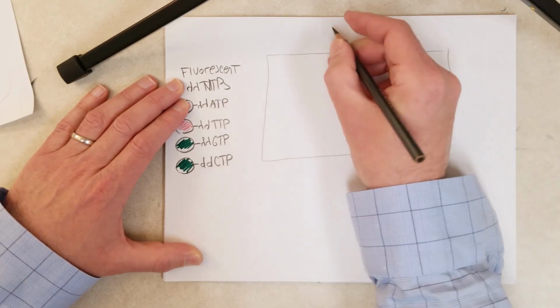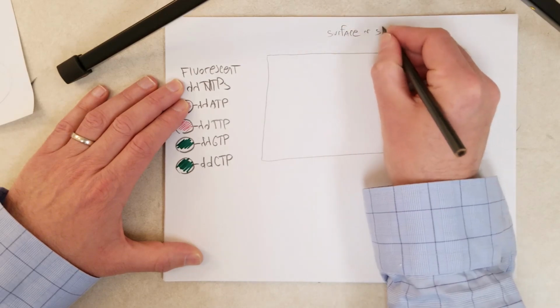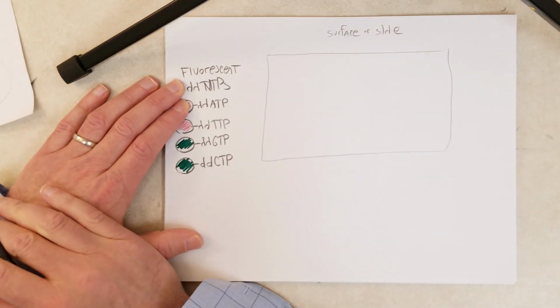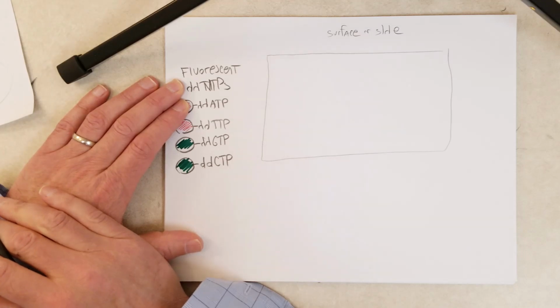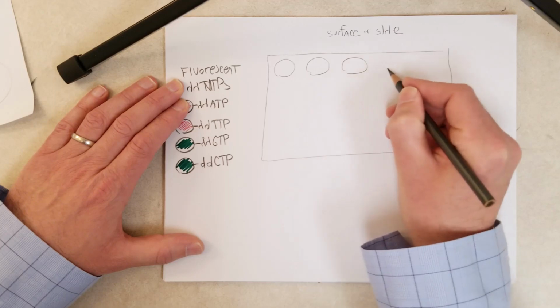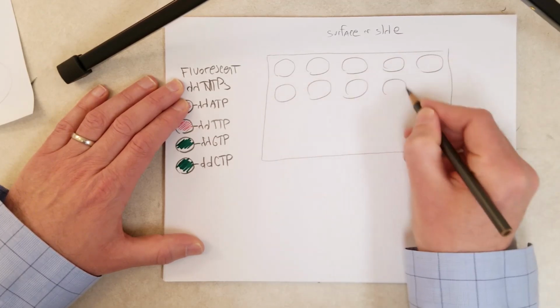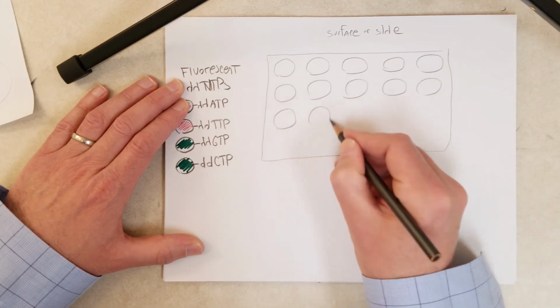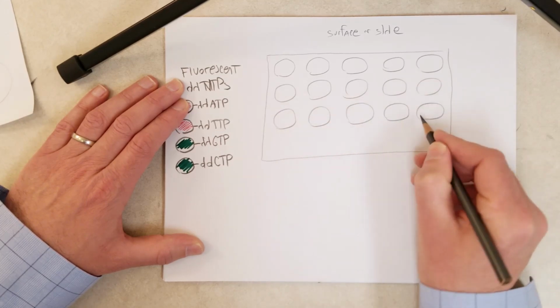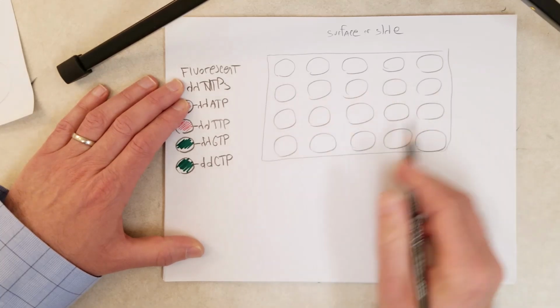Okay, so here, let's say this is a small surface area of the slide in the chamber used to genotype John Doe's DNA. Here's a small section showing 20 different microscopic beads.